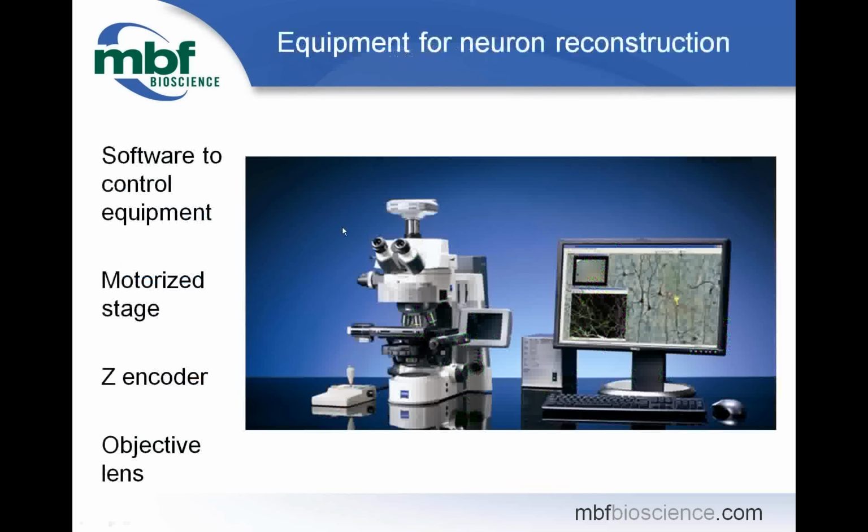So I'm going to move on now to the equipment requirements. Many hardware configurations are suitable for performing your neuron reconstruction. Today I'll be performing the demonstration on a Zeiss Axio Imager Z1 microscope, which has a motorized objective turret and internal Z motor and encoder.